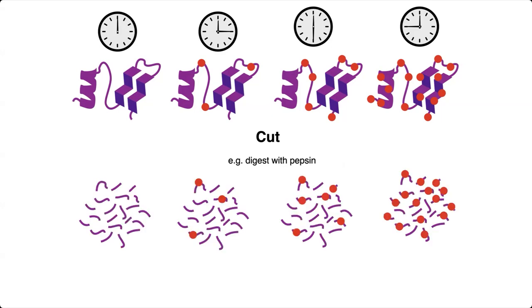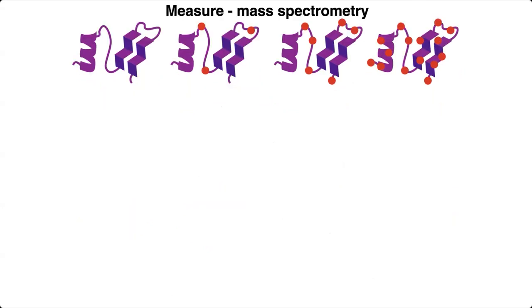This is going to cut up the protein into different peptide fragments. And those fragments will then be lighter or heavier depending on whether deuterium was exchanged in those regions of the protein. So you can use liquid chromatography in order to clean up and separate those different pieces, and then measure the weights of those pieces. Typically, instead of just measuring the weight, what you're doing is measuring the mass to charge ratio using a technique called a mass spectrometer or a mass spec.